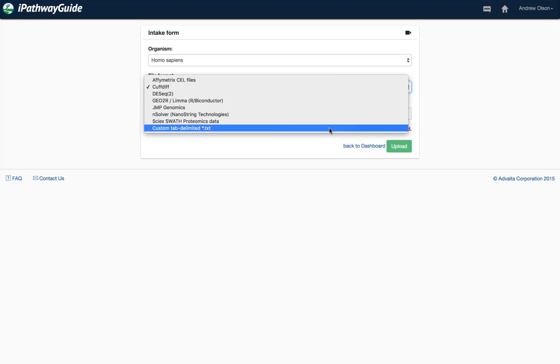The only thing is that you will need to translate your protein IDs to official gene symbols. So if you have, say, UniProt IDs, then there are a number of translators out there. If you want to send us a question, I can certainly send you a link to the translator that I have found to be most useful. But if you have official gene symbol, fold change, and p-value, you should be ready to rock and roll, whether it's from transcriptomics, RT-PCR, targeted expression, or proteomics.